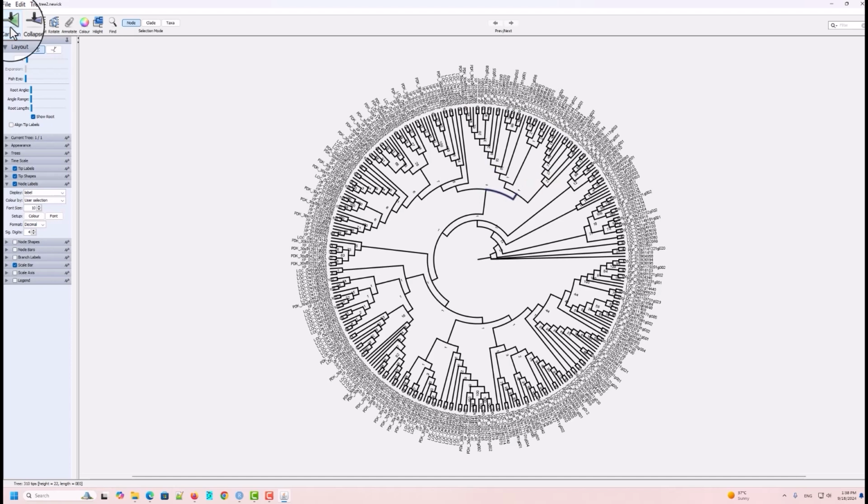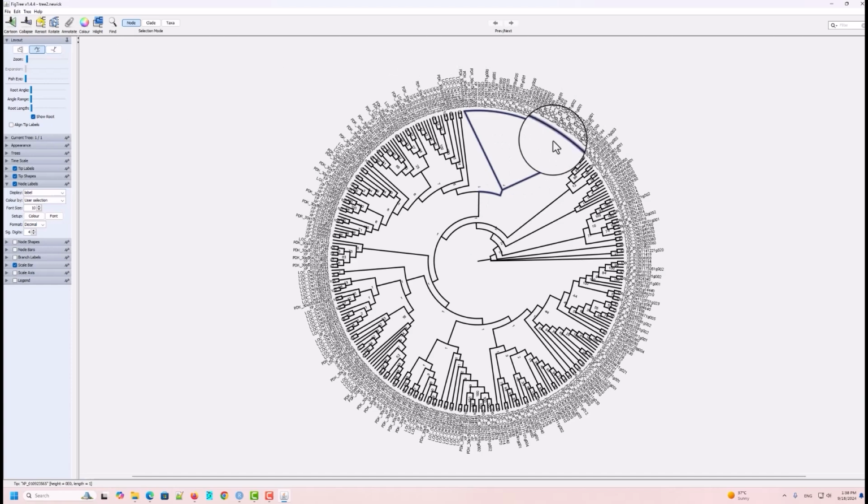Now if I click here, you can write here what this group is. Because if you read high standard publications, you can see such types of trees in those publications. So now I will remove this.